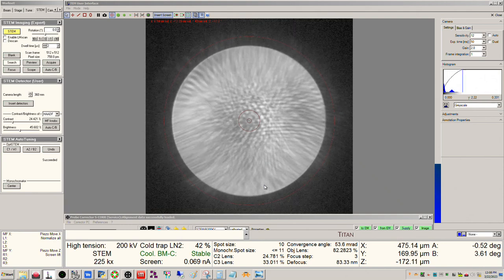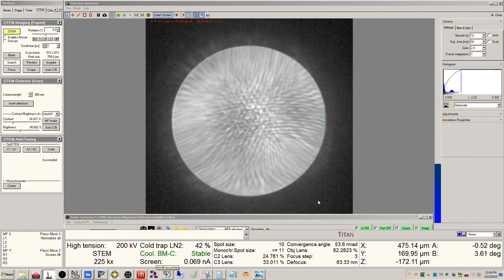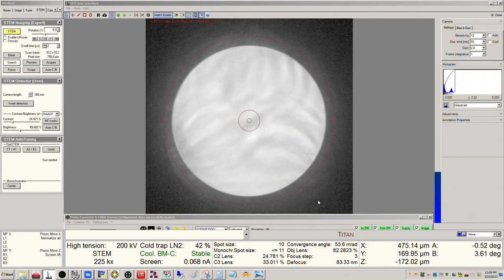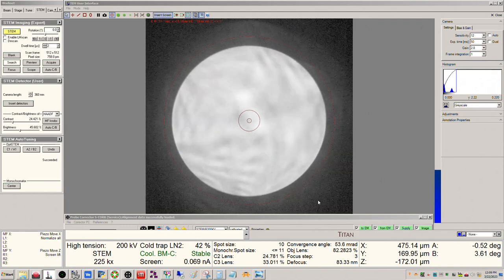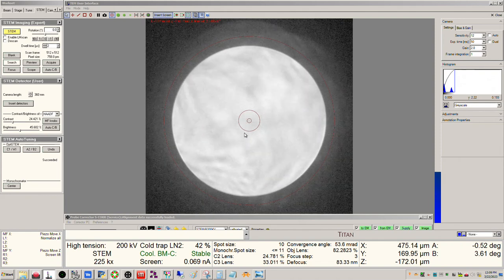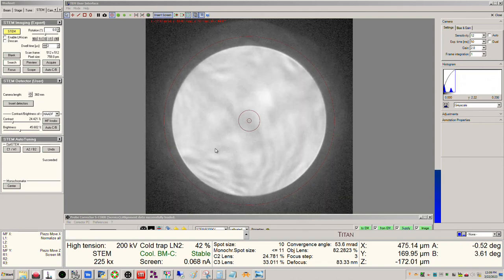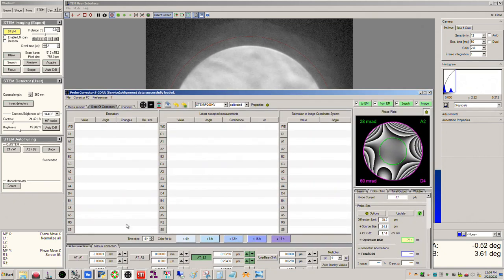And you can see I have my piezo move Z activated here. So if you have a piezo enhanced stage, this is great for precisely focusing by using your Z here. So you can see, right, when I get this here, I'm seeing kind of this nice flat region and kind of like six-fold symmetry on the edges. And this is basically what we're looking for here. So we are really close. We can't get two-fold any closer with the coarse, so we can leave this alone now.